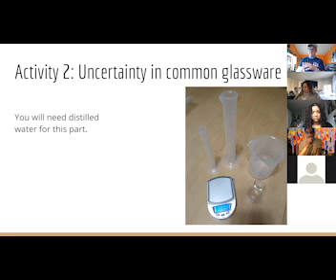So now we're going to need our distilled water, or filtered water, or tap water if that's the only water you have. Now, what's important here is that you don't just get cold water from the tap and then immediately take the temperature of it and call that your temperature. I have had my distilled water sitting in this glass for the last hour and a half.